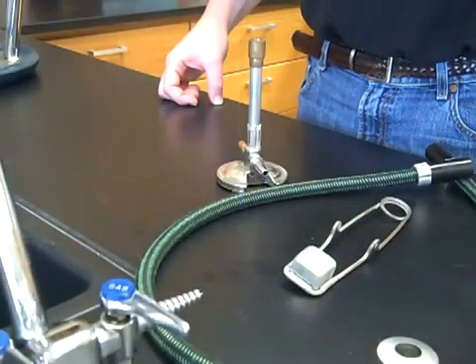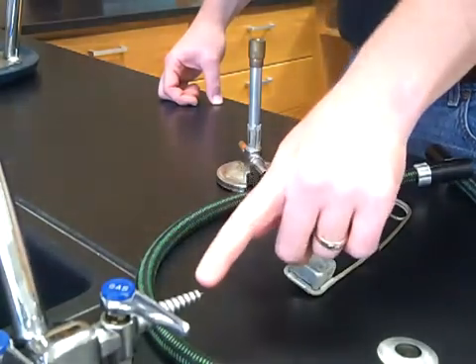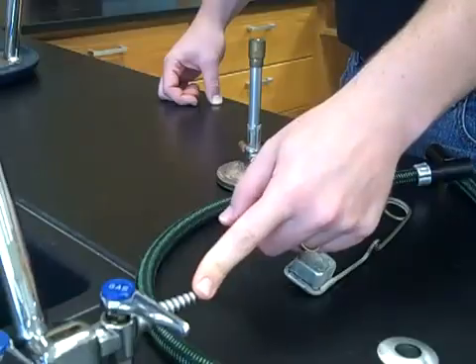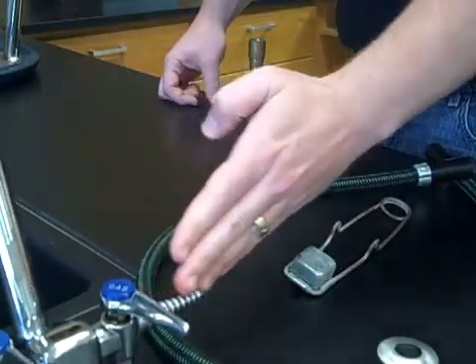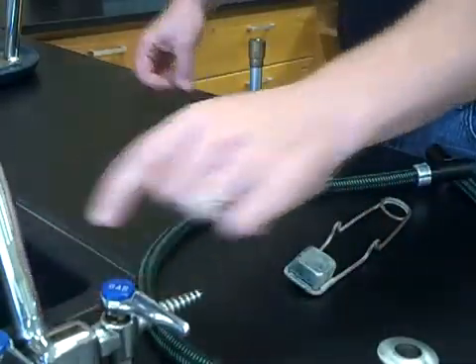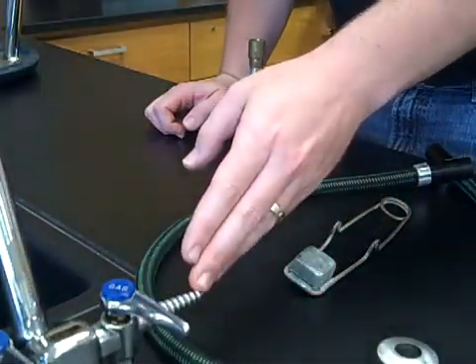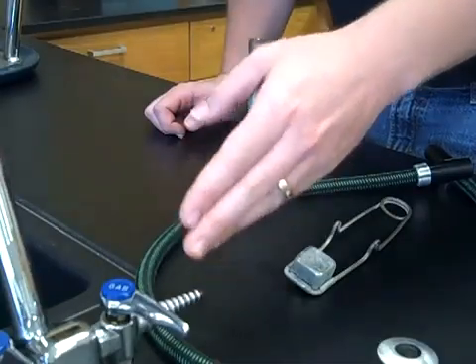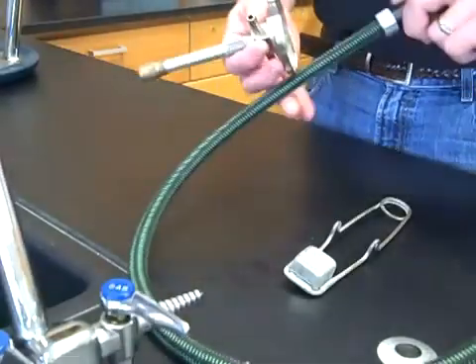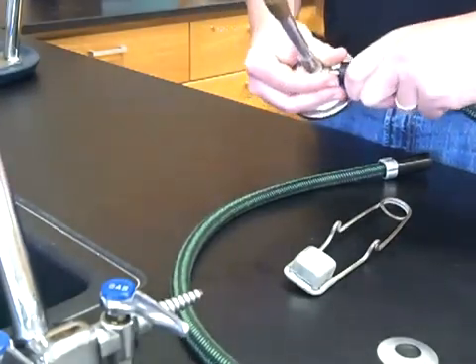When assembling the Bunsen burner for use in the lab, there are several things to pay attention to before you light the burner. First, the main gas valve from the fuel supply — coming out of the desk, you have your gas jet, and the handle should be in a perpendicular position to the gas jet itself. That is the off position, and it doesn't matter which side the handle is perpendicular on. When you hook up your Bunsen burner, take one end of the tubing and hook it to the gas inlet on the Bunsen burner.